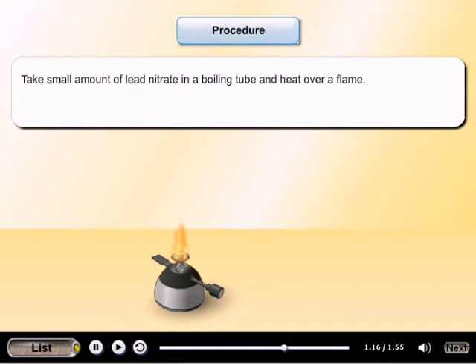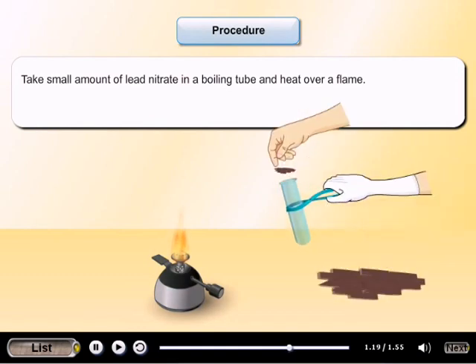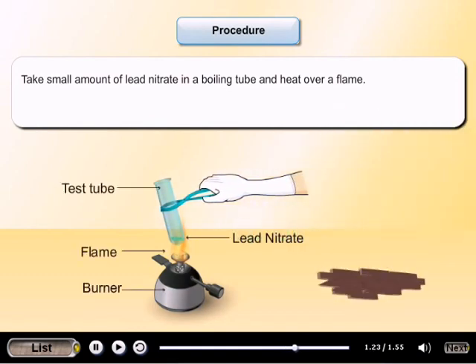Take a small amount of lead nitrate in a boiling tube and heat over a flame.